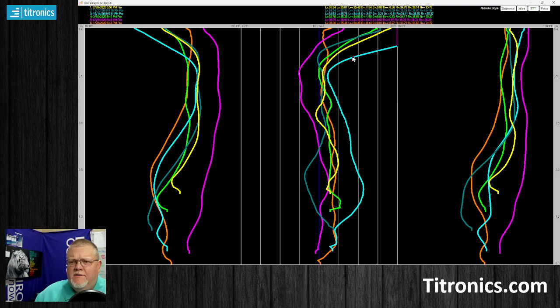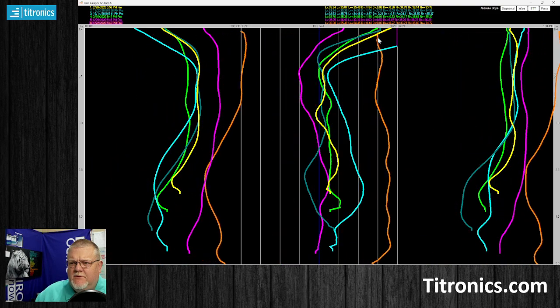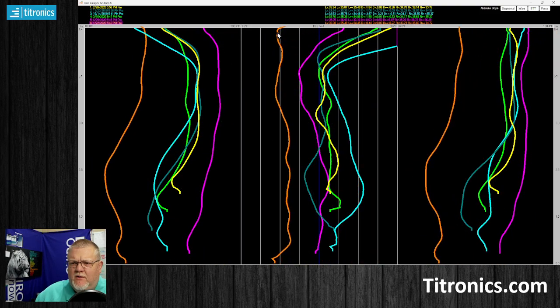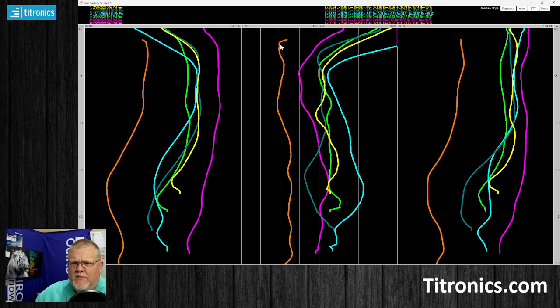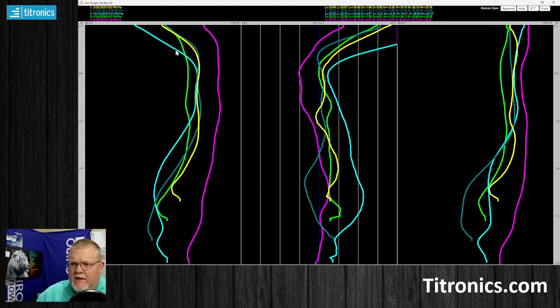If you look at this, there's one that kind of doesn't fit with the other, and it's this red one here. So I'm going to click on it. I'm going to hold down Control and make sure I have the right one. So that's the right one. See, it doesn't really fit with anything else. I'm holding down the Control key and clicking on that one. So I really don't want that one. So I want to make sure it stays clicked. I'm going to hit Delete.